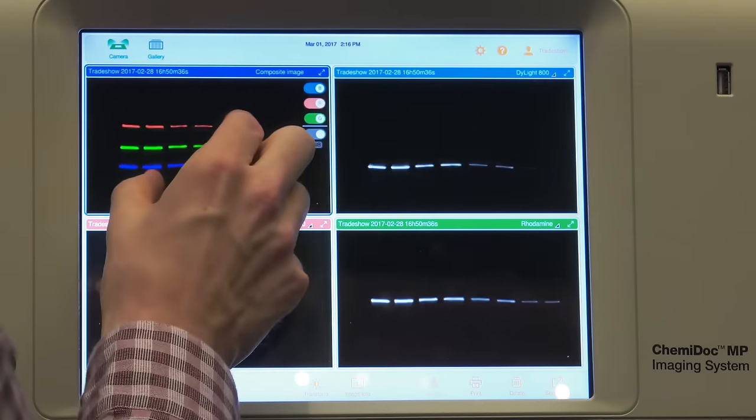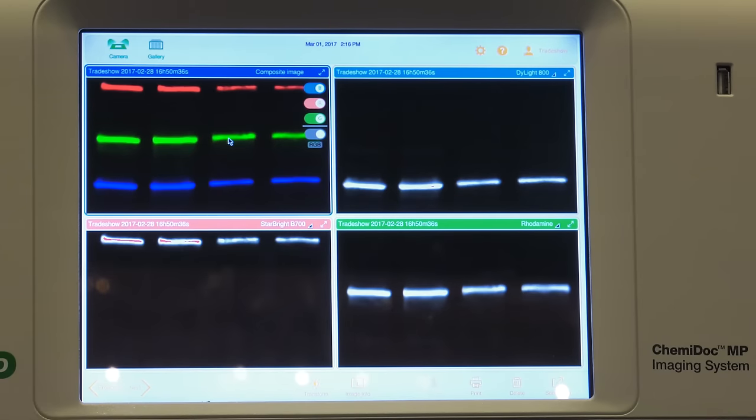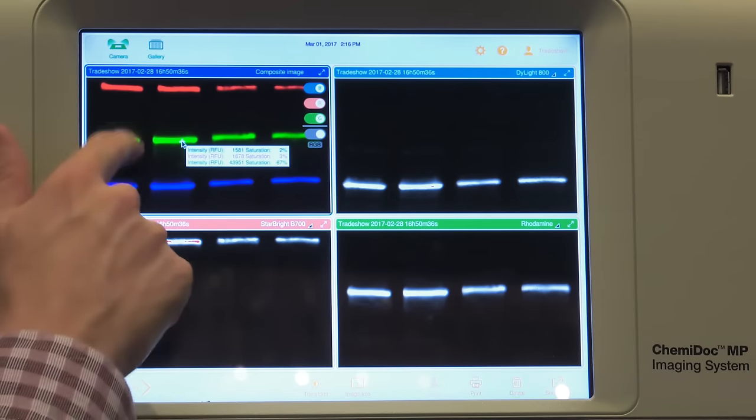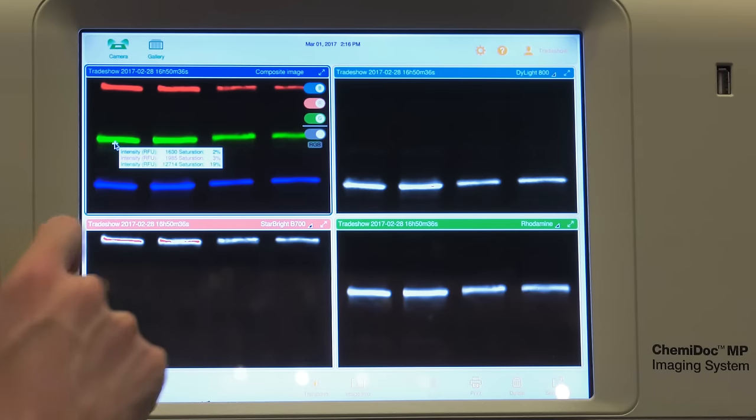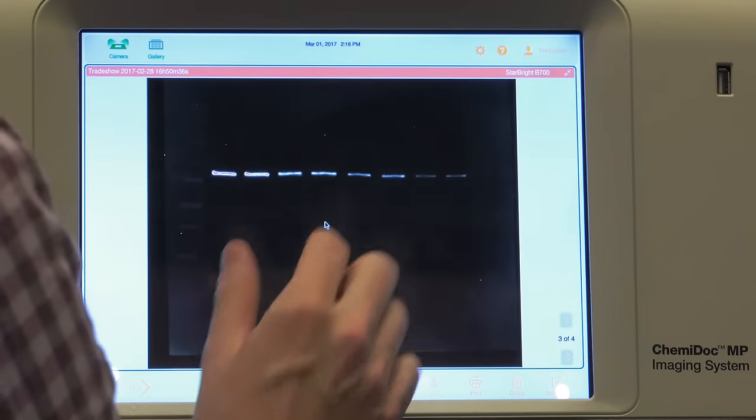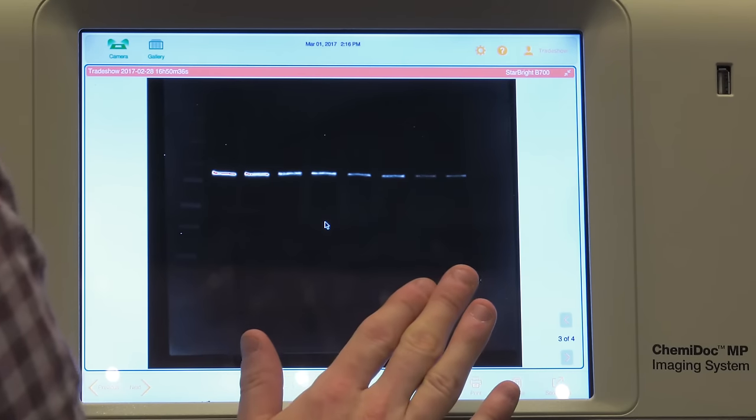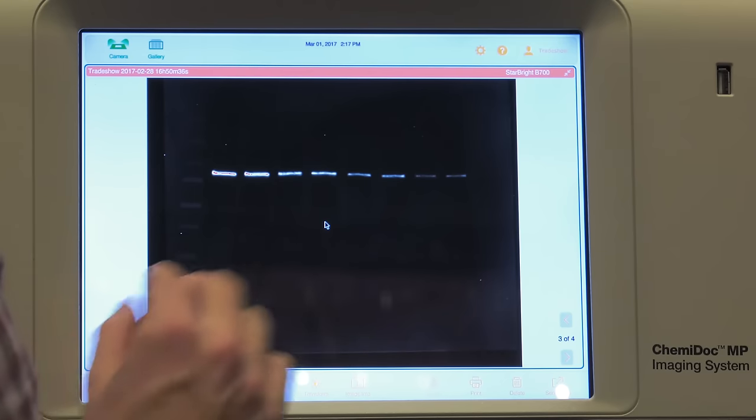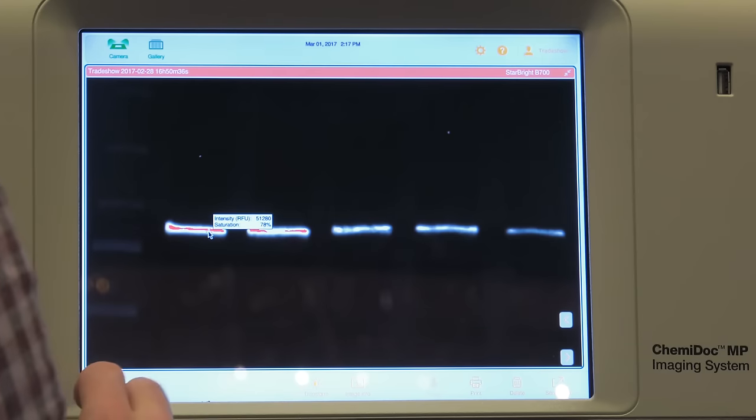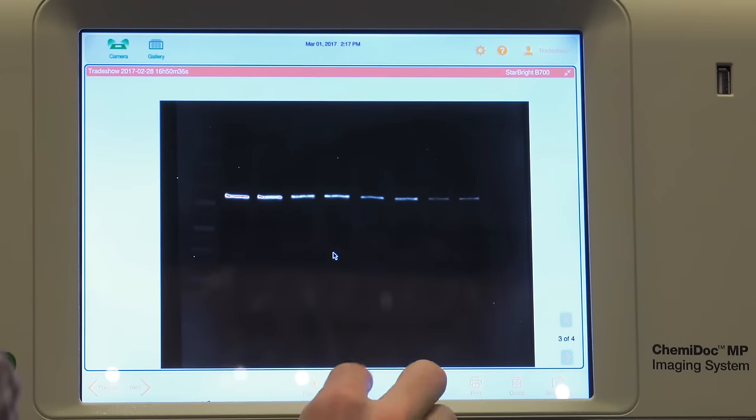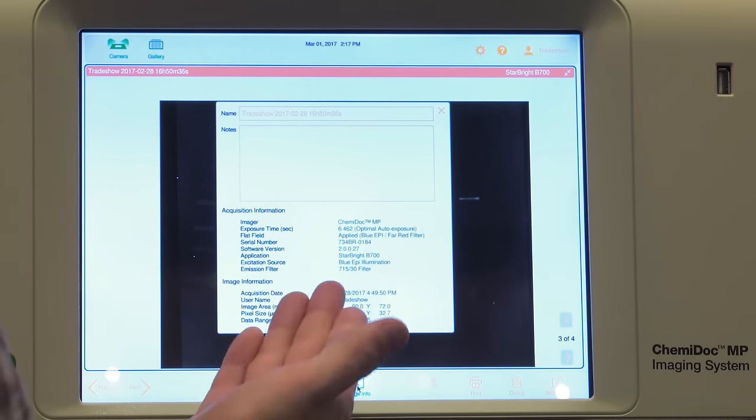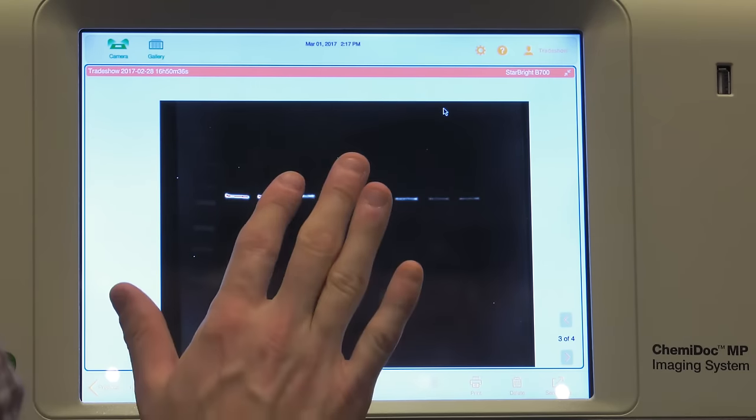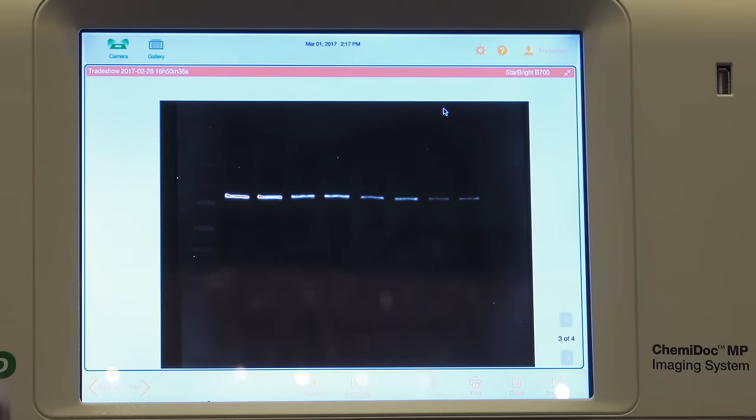Very, very simple interface. So I'm just going to zoom in because I'm kind of curious to see a little more. See that resolution? Really, really nice. And this is really cool, too. You can tap on the screen. And anywhere you tap, it's going to give you different signal intensities. And this is helpful in determining, have I hit saturation? Is there a better exposure time for me? Really, really nice. Let's go ahead and let's just focus on Starbright here. So I've expanded so I can see my image here. It's just a very simple dilution series for, I think it's ATG7 target. And again, you can see right away we've got a little saturation here. So that's not great. So we've got to go ahead and we've got to lower the exposure time. And you can very, very easily say, hey, let's see. What did I do to get this image? So in this case, I took an image in six and a half seconds. So maybe I needed to decrease that exposure time just a little bit. And we have tools to, again, help you pick a better exposure option.